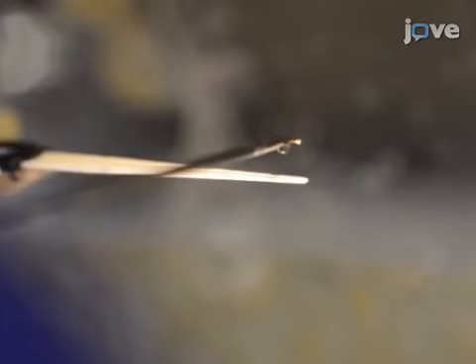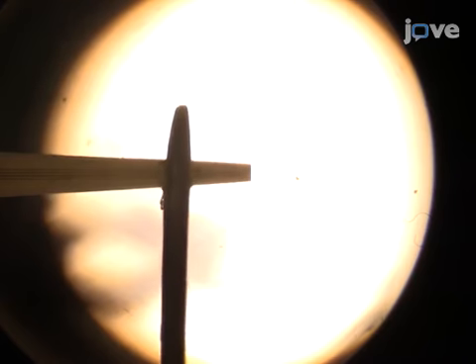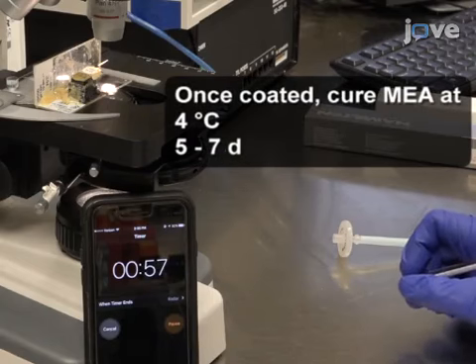To target the MEA recording sites, under a dissecting microscope, apply the solution to the appropriate recording sites by briefly contacting the recording sites with the solution droplet, which represents one layer. Set a timer for one minute between coating applications to the recording sites.